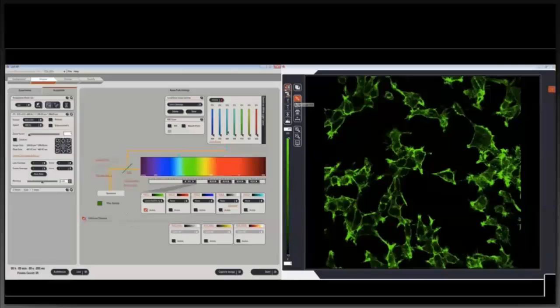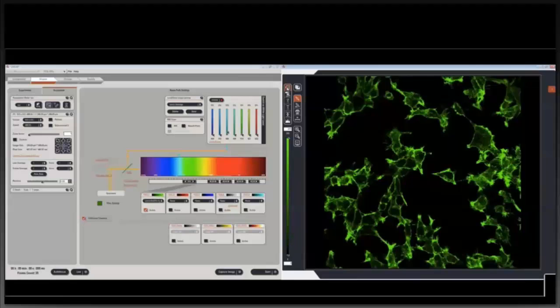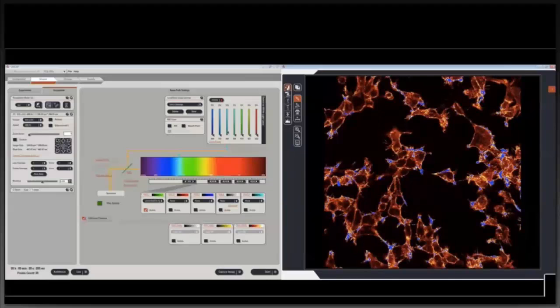A good way to do this is that you can change the lookup table settings. So there's a button up here. And as you see, we go between grayscale and false color. I have currently this in green. It helps a bit to know you're looking at green, so looking at green helps make it simple. The other option is a saturation lookup table, which is good to look at whether you're saturating your image. You don't want to saturate your image.